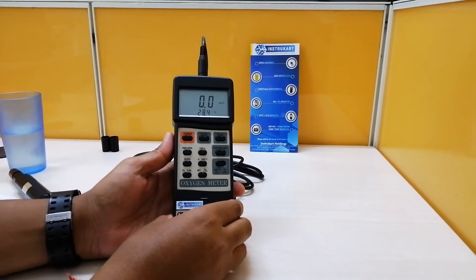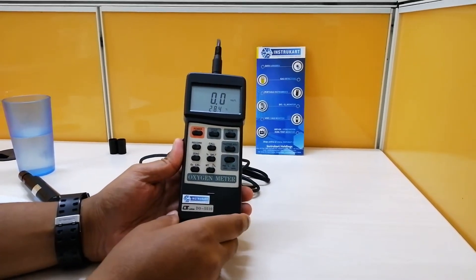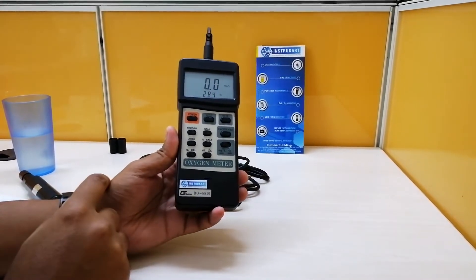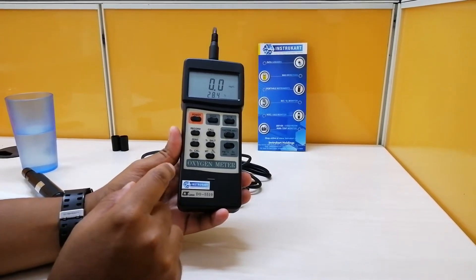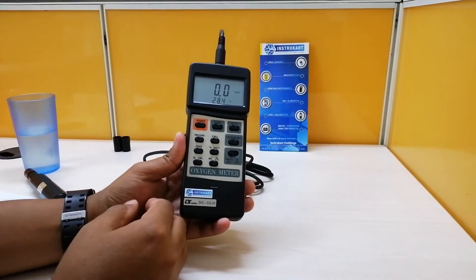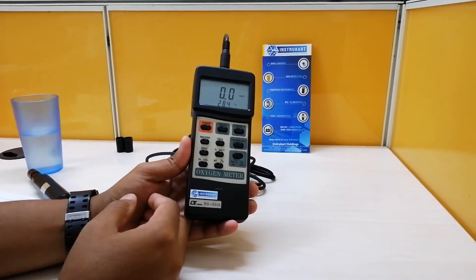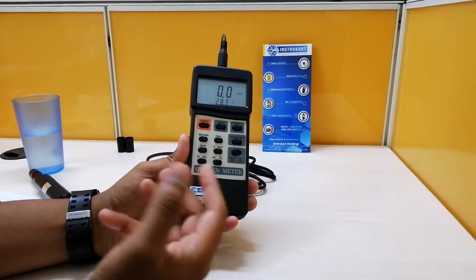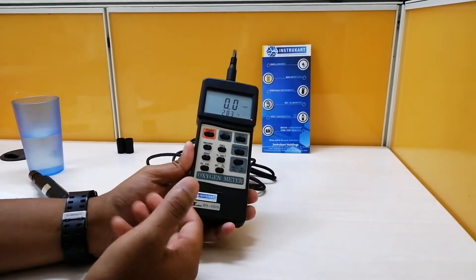Hello and welcome to Instrukart Holdings, your worldwide instrument partner. We have got a dual oxygen meter from Lutron, model number DO-5510. This is a dual oxygen meter which gives recordings for dissolved oxygen as well as oxygen in air — a very handy meter for multi-purpose applications including aquarium, medical research, agriculture, fish hatcheries, laboratories, water conditioning, mining industry, and schools.